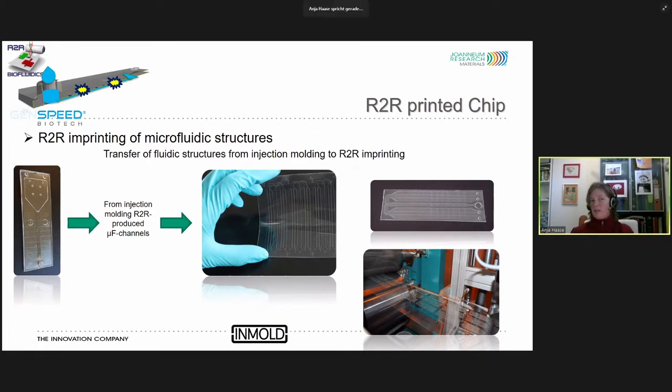And if you need a lot of waste reservoir, that's not sufficient. So that's why we put the waste reservoir on the side of the chip. We filled the whole chip area with our waste. The sensor channel is still in the middle. And that's a typical design of the master, and then it's replicated for the roll. And then here you see the roll-to-roll replication.